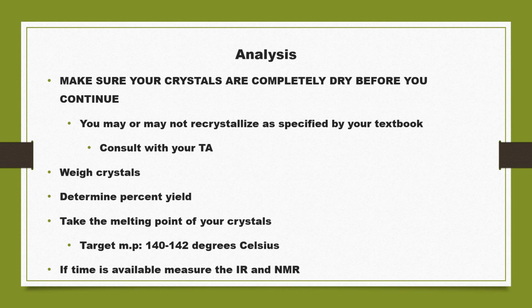If you have access, it's also better to measure the IR and NMR, so that you can easily compare the spectrums with the standards, so that you can confidently tell that you have synthesized the acetylsalicylic acid.